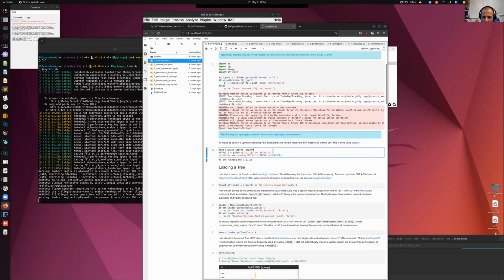In case you are not familiar with PyImageJ, you should definitely check their tutorials. The documentation is amazing, and they have been doing great work to make everything super intuitive. And so, as you can imagine, now we're going to access Java classes from Python. The mechanism to do so is through scyjava, and that's the declaration that you have to do. And now these are the imports that you would typically do in Java.